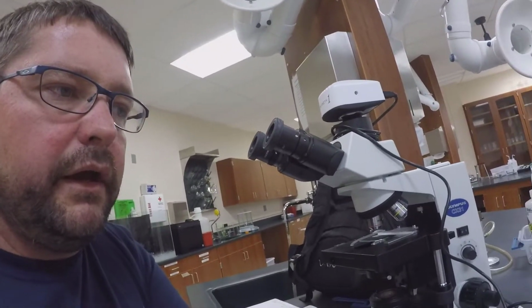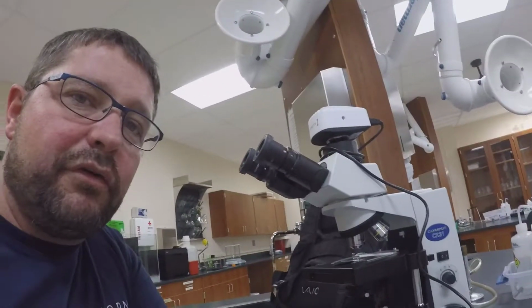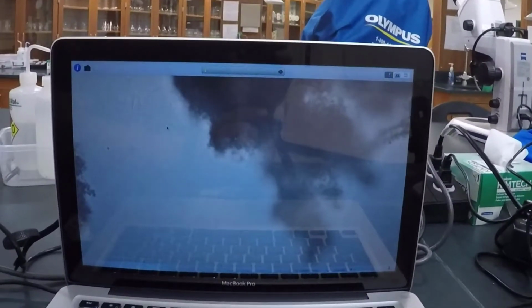Okay. And the key to examining pond water, things that are in liquids, especially if you're examining it for very minute, very small creatures, is to get a little bit of sediment with it, or get something that you can focus on. So if you get a little bit of sand, decaying plant matter, decaying animal matter, or something like that, then you have a focusing point. So get one that's stuck.